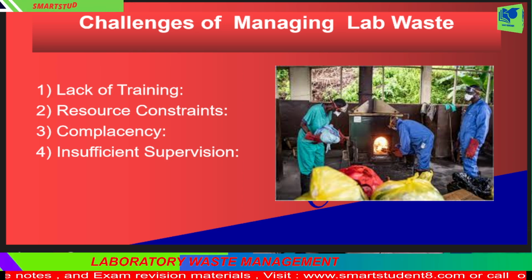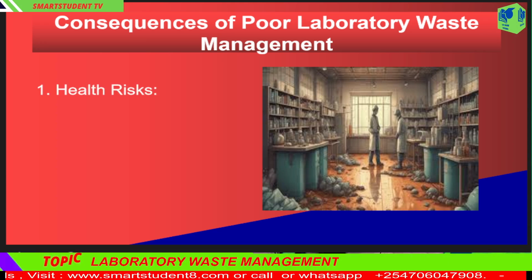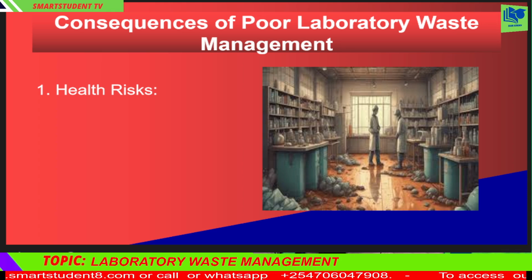Consequences of poor laboratory waste management. The consequences of neglecting waste management in laboratories can be severe and far-reaching. These include: 1. Health risks, exposure to toxic chemicals, infectious agents, and sharp injuries.